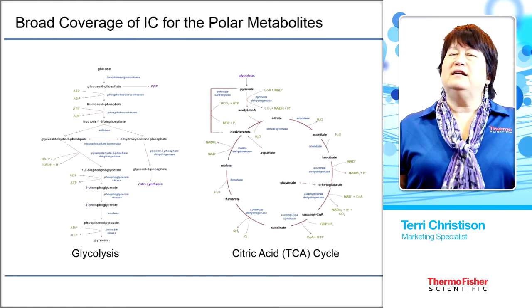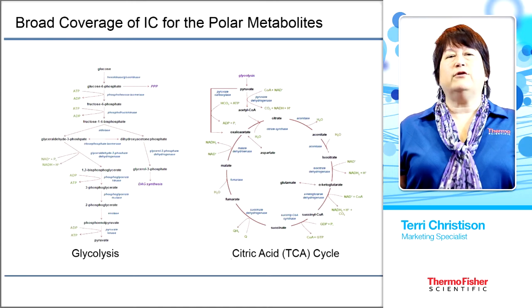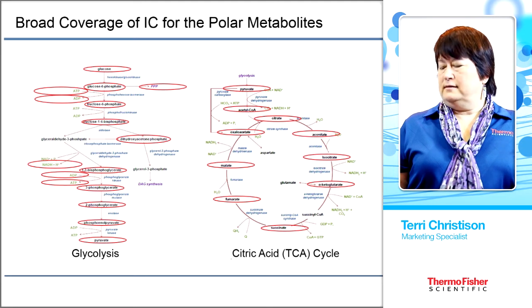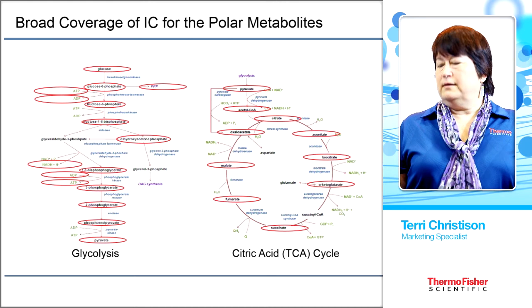Now, unlike other separation methods, IC has a broad coverage for polar metabolites. And here we've circled the analytes that ion chromatography can identify and separate.